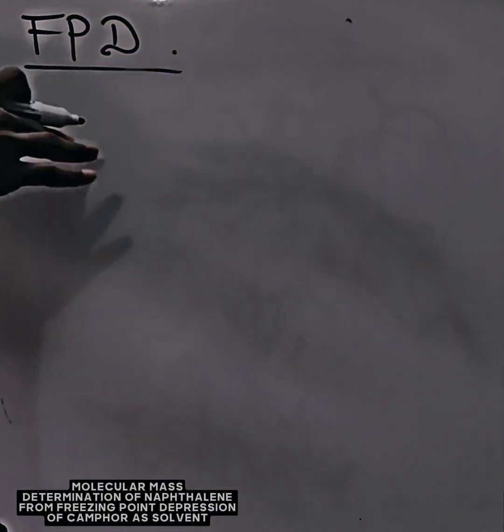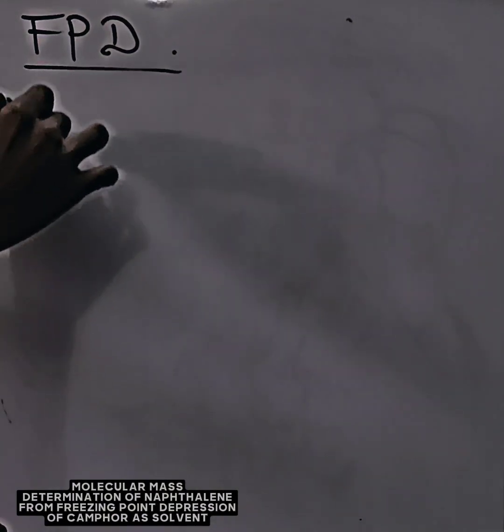Now, the principle behind the freezing point depression. What is the principle behind freezing point depression? Now, it relies on the principle that when we have a non-volatile solid.